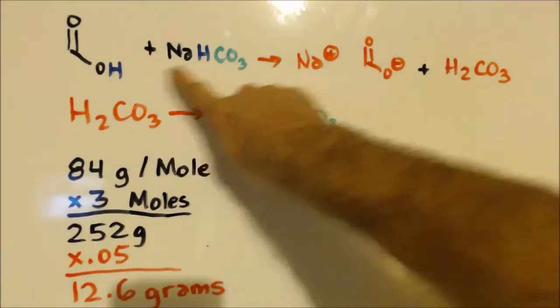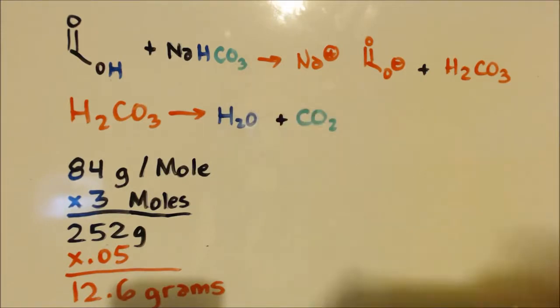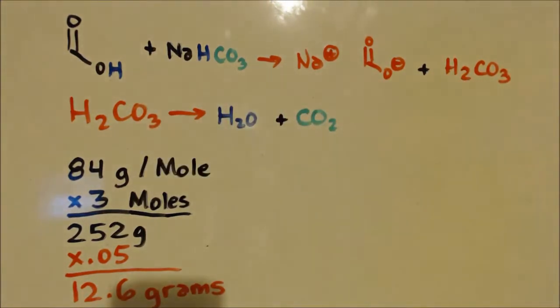You can see it takes two H's here and one O off of there, and you got H2O, and you're left with CO2. That's what you get, which basically breaks down to water and carbon dioxide.